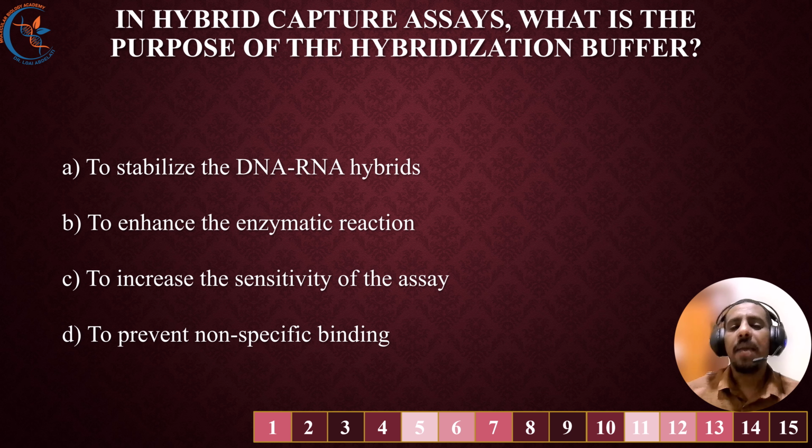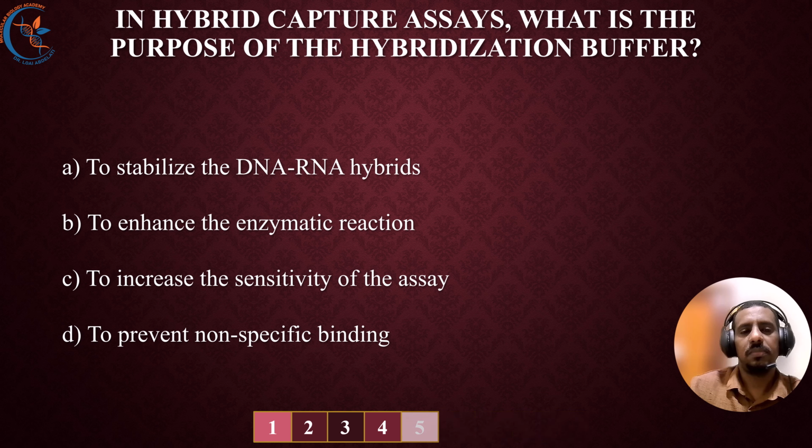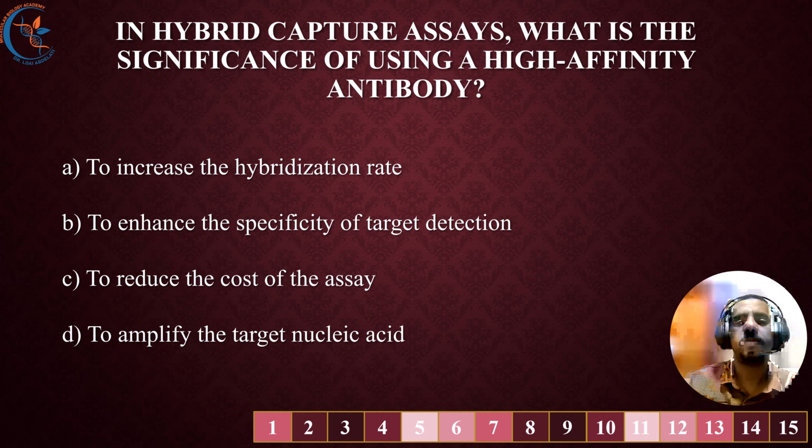In hybrid capture, what is the purpose of the hybridization buffer? The correct answer is to stabilize the DNA-RNA hybrids. Let's move on.